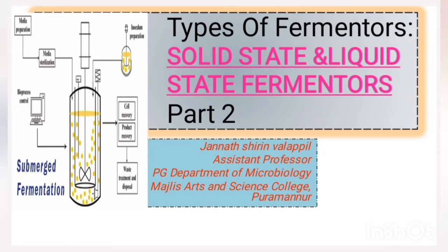Welcome all. Let's continue with our topic, types of fermenters. In the last week, we have discussed three types of fermenters. Today I am going to discuss two types of fermenters, that are solid state and liquid state fermenters.